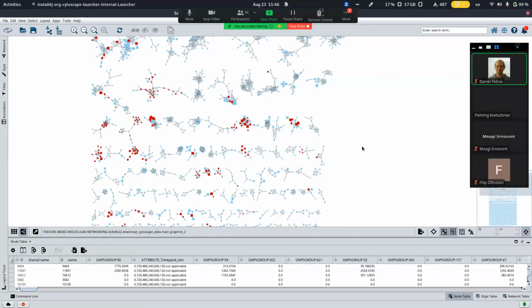Okay, I hope everybody can hear me, and also everybody can see what I'm showing right now. First, welcome also from my part. I'm Fleming Kretschmer, and I'm going to guide you a little bit through the hands-on part of this Sirius session.